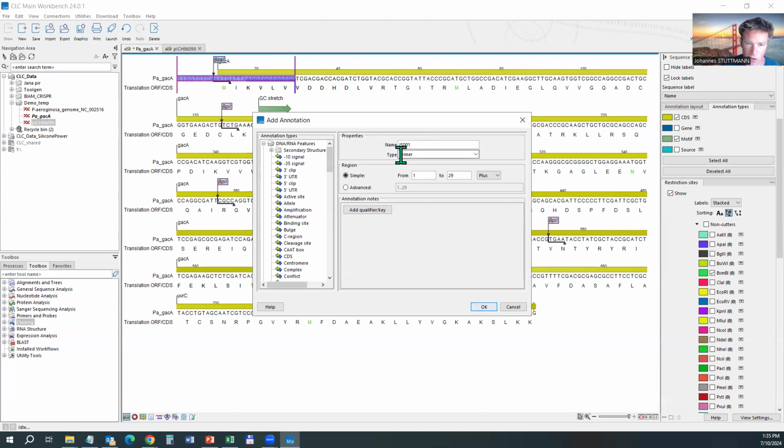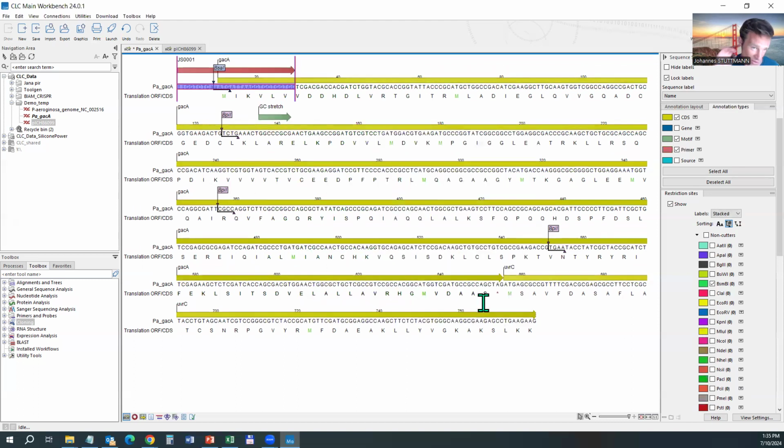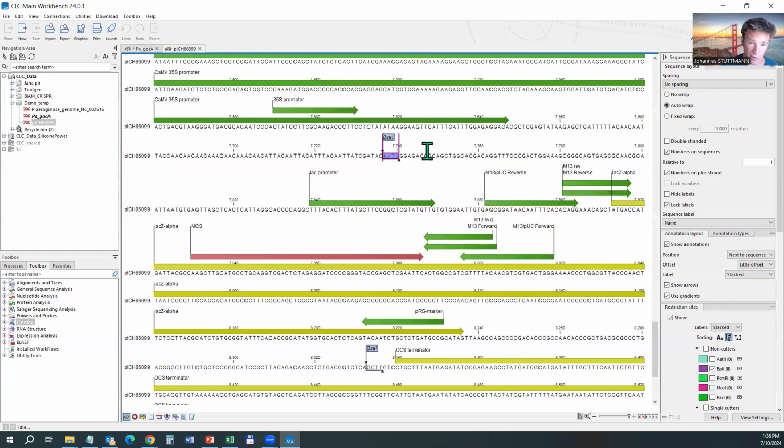I just started working in the lab. I call this 001. Actually, maybe like this, because I anticipate that I will order more than 1,000 at some point of time. So if I would make a PCR with this oligonucleotide on the Pseudomonas aeruginosa genome, then I would create an adapter suitable for cloning into this left-hand side. So I have to take care of the right-hand side.